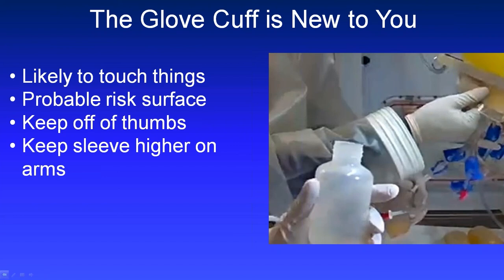But you might want to think about that at other times too, just trying to keep that sleeve material up higher on your arms and keep that cuff off your hands while you're working, particularly for people that have shorter arms like me.